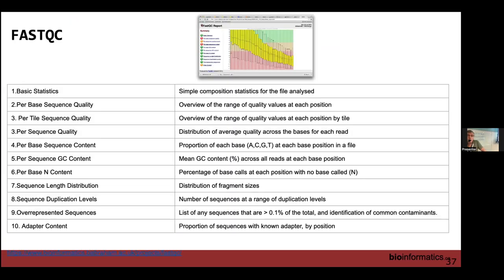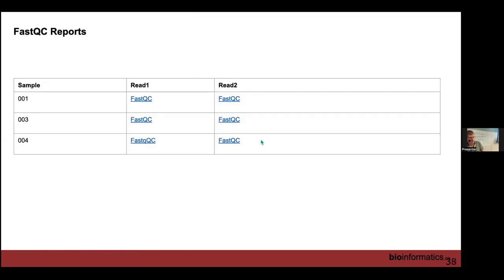The FastQC report that we'll look at is basically generating a bunch of statistics related to the reads without really knowing what those reads are or how they relate to the genome, just looking at the data itself. What we're interested in there is getting basic statistics on what's in the file, how many reads we're seeing, length of the reads, things like that. And then we create a lot of images in here. I'm not going to go through the FastQC report. Maybe I can do it right now because I have some examples here.